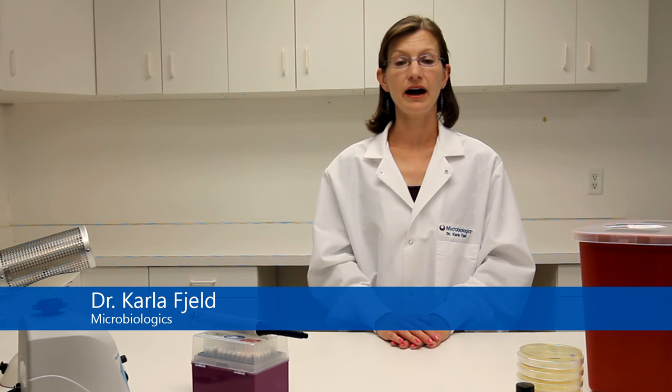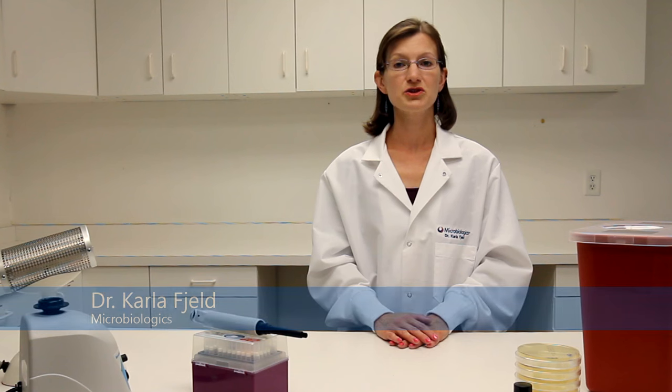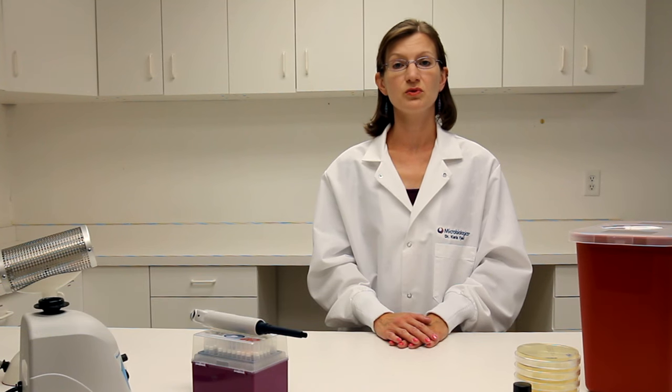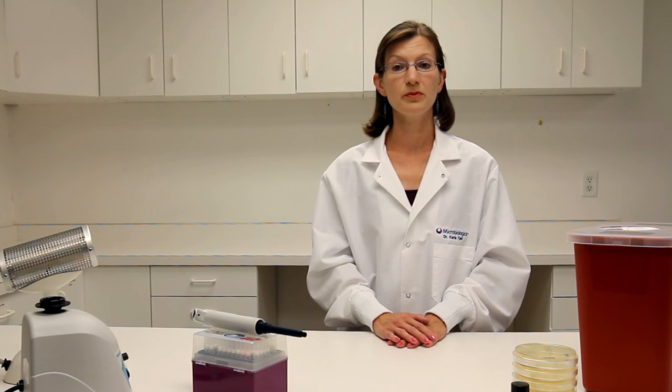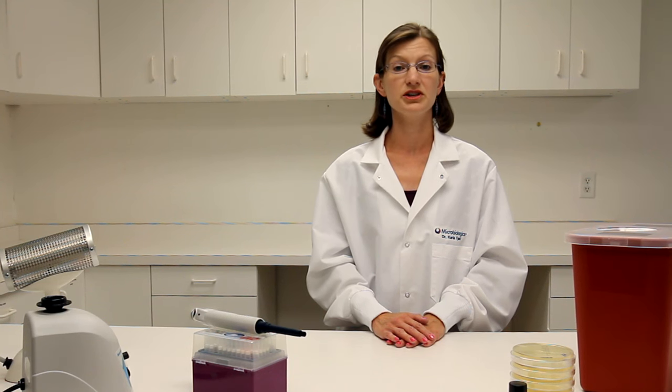In this video, I will explain the serial dilution process and demonstrate how to perform dilutions when using the Microbiologics ePower product. Dilution is the process of making a solution weaker or less concentrated. In microbiology, serial dilutions, or log dilutions, are used to decrease a bacterial population to a required concentration. The purpose is to achieve an appropriate concentration for a specific test method or to achieve a countable agar plate.